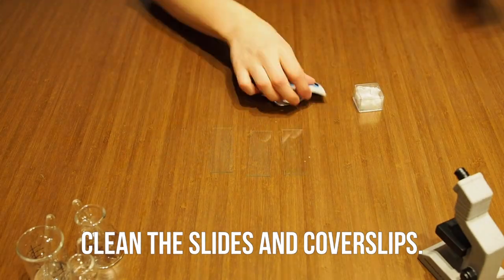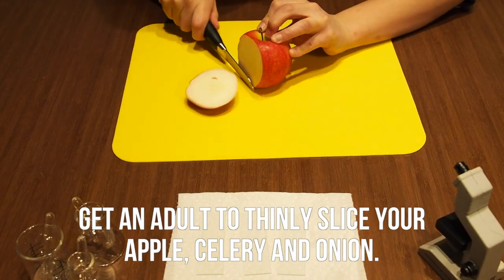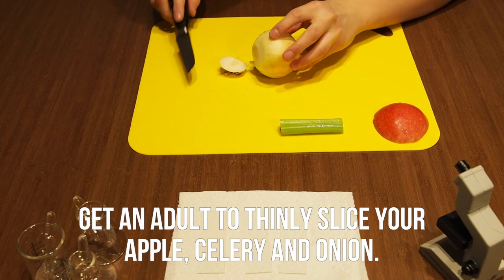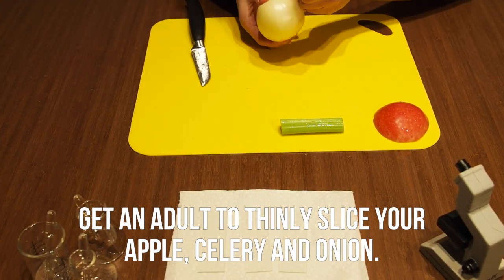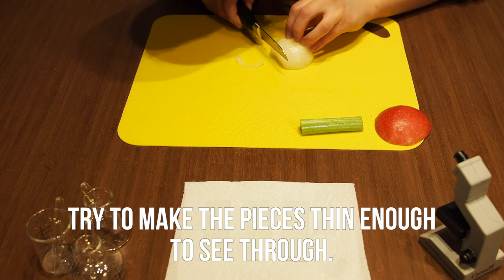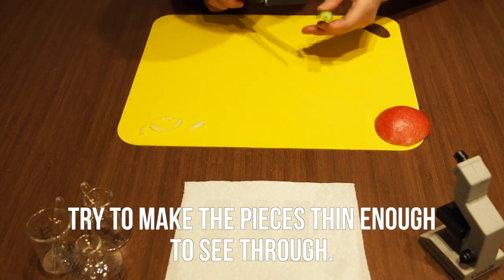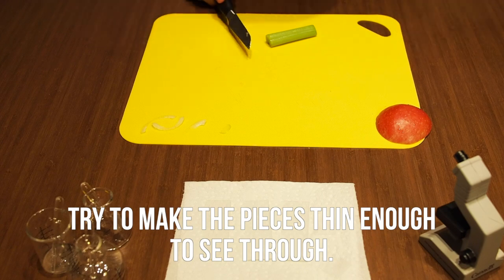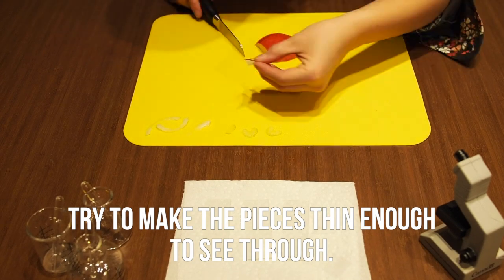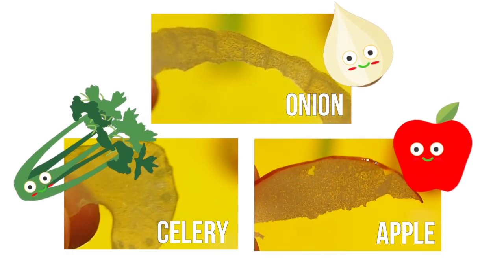Start by cleaning off the slides and coverslips using alcohol wipes. Get an adult to thinly slice your apple, celery, and onion. I suggest first cutting them into larger sections and then cutting thinner pieces. Ideally your pieces will be thin enough to be see-through when you hold them up to light. This will make sure that the light from your microscope will be able to pass through your sample. Here are my fruit and vegetable slices.